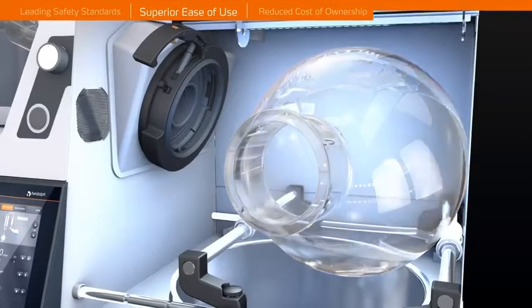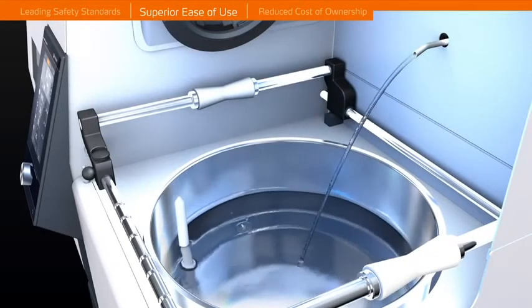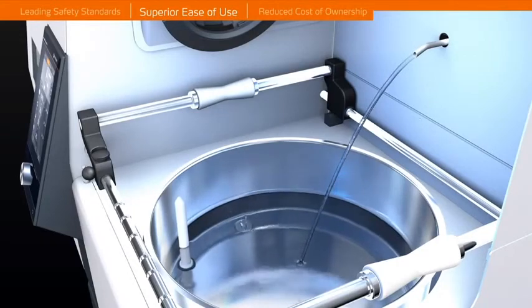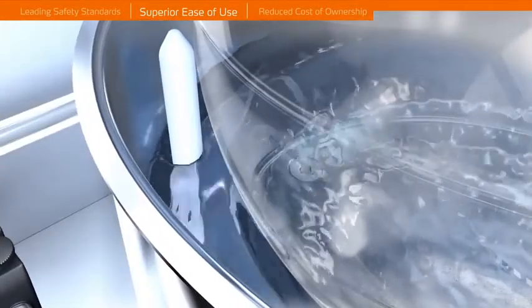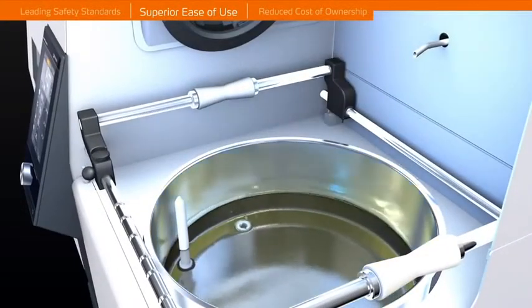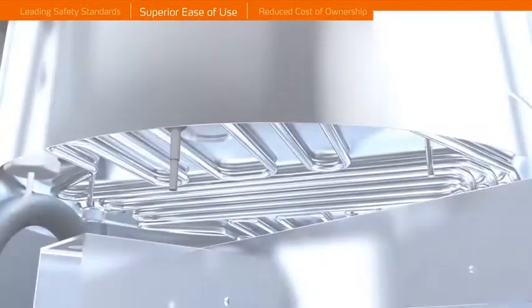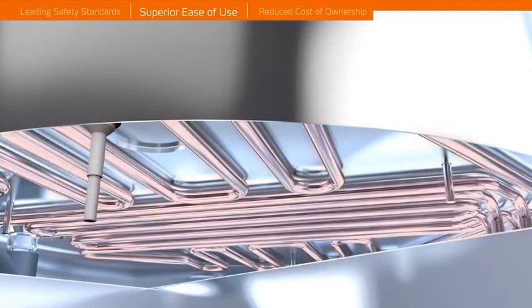The evaporating flask is easily removed, and the flask handling system allows for an easy flask change by only one person. The self-filling universal bath ensures you will never run dry due to low fluid levels. Overflow situations are prevented due to an integrated sensor system monitoring the maximum filling level. The universal heating bath is built for water and oil and has a drain valve allowing for easily changing the liquid. Integrated heating coils allow for easy and fast cleaning of the heating bath.